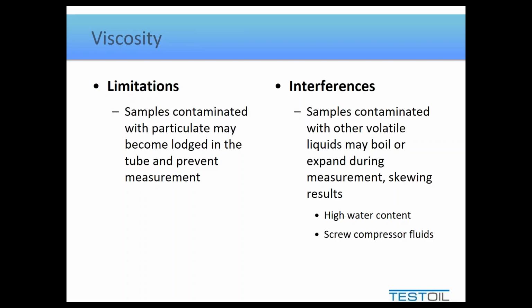It can make it either high or low or just simply an error message. So when we have high water content, your viscosity may not be entirely accurate. That's not considered too big of an issue because that's your problem, water content. Not so much do we have the correct viscosity. We know the viscosity will be affected by that water.